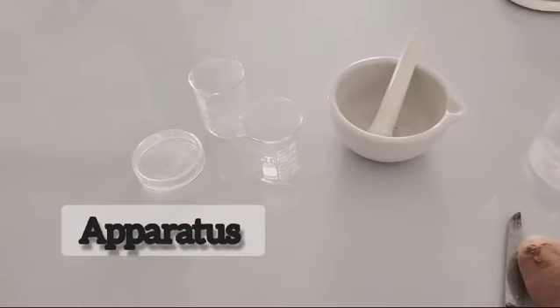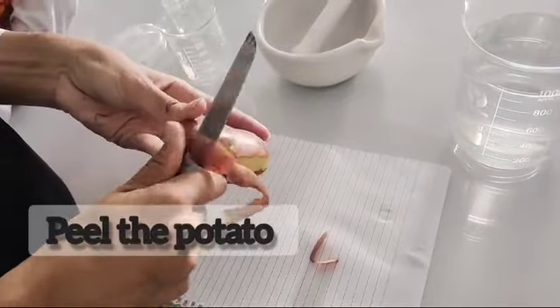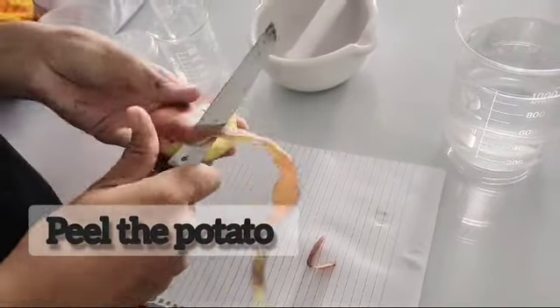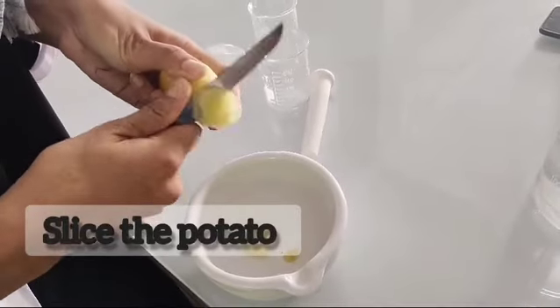First of all, wash all the apparatus. Now, peel the potato carefully. Before crushing the potato, cut it into small pieces.